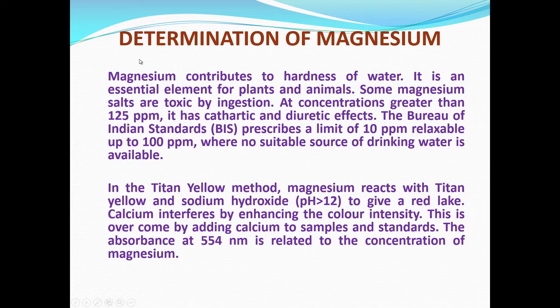I would like to move on to the determination of magnesium. In this I will just give you some sort of introduction, because especially for magnesium, what is important is that it is a ubiquitous element, it is a micronutrient, it is present in sea water, it is present in borewell water, it is present in drinking water. Therefore, it is very important that magnesium should be determined.